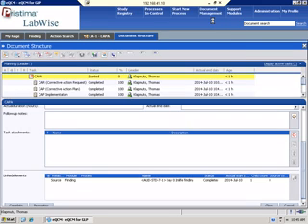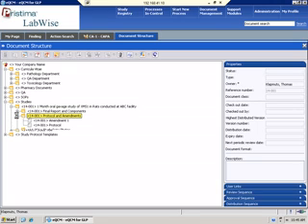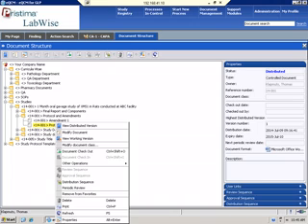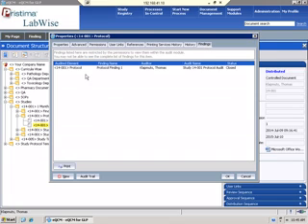So we'll go into document management. And so if we look at the study, and I did a protocol audit, and I look at the protocol document, by keeping everything within the system, we can look at the findings on our protocol. And so here we have a protocol that had a finding from an audit. And so study audit 14001 had a finding. So I can go look at the findings.